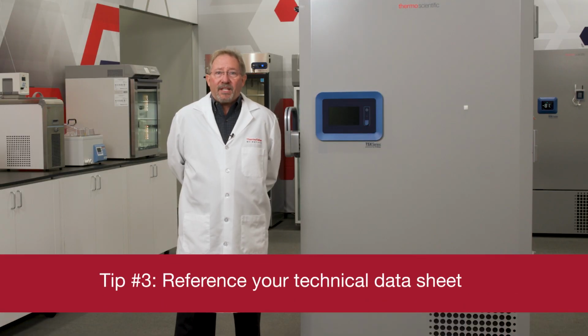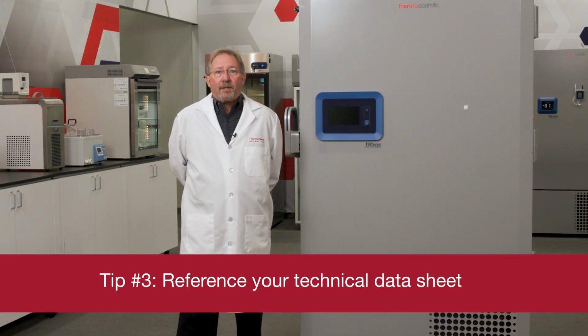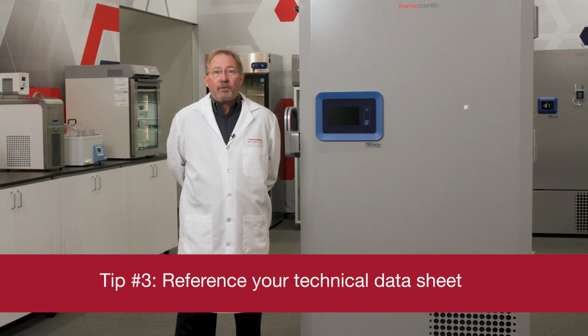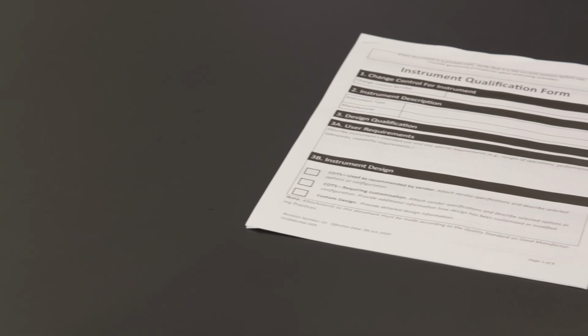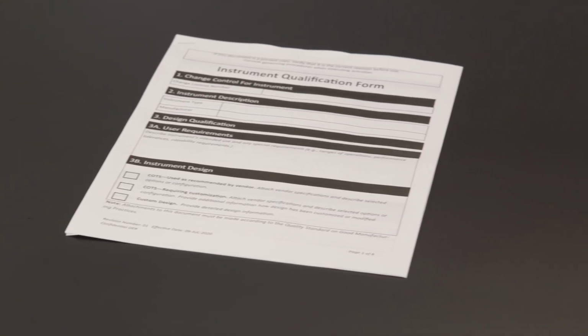Previously, I mentioned a DQ. This is important as it provides a checklist of facility requirements your new freezer will need. Your DQ should include electrical requirements, ambient temperature, and heat load. You don't want to install 10 freezers in a room that will end up getting too hot, and it might activate the overheat safety feature.